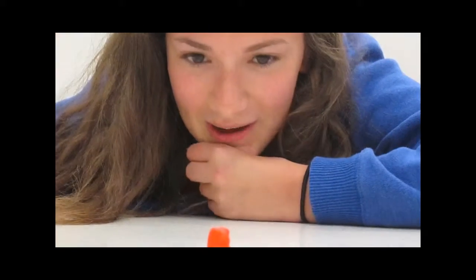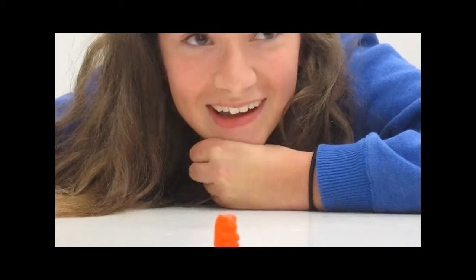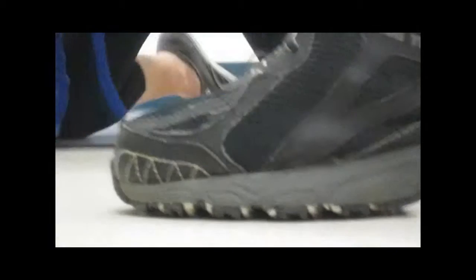Here we see a gummy bear in its natural habitat, but we must be careful because it's very territorial. Now let's see what happens when we add 2 grams of potassium chlorate. But before we do, let's have a look at some safety precautions that we should follow.